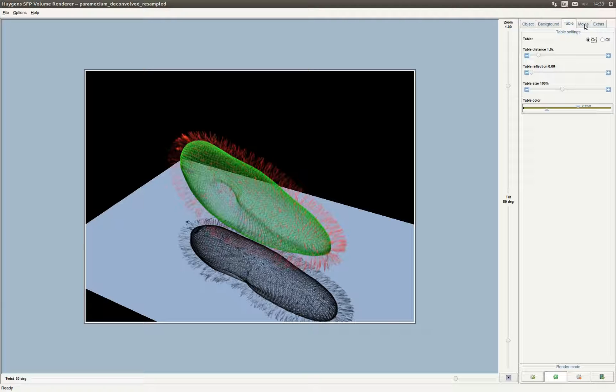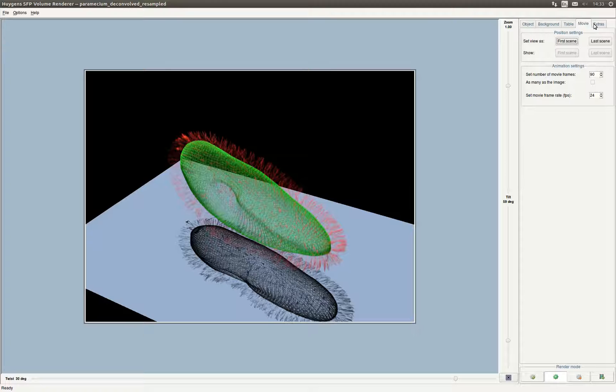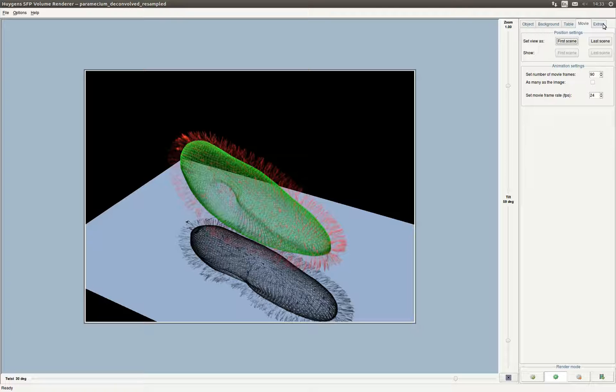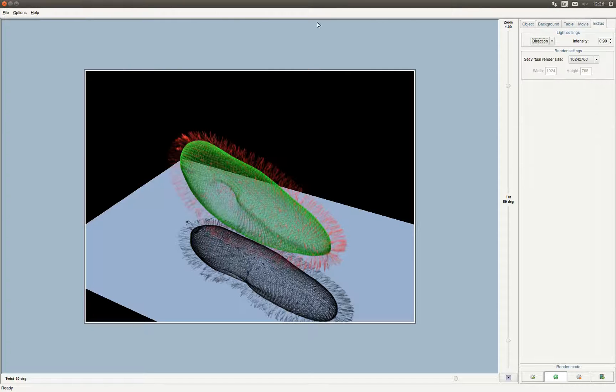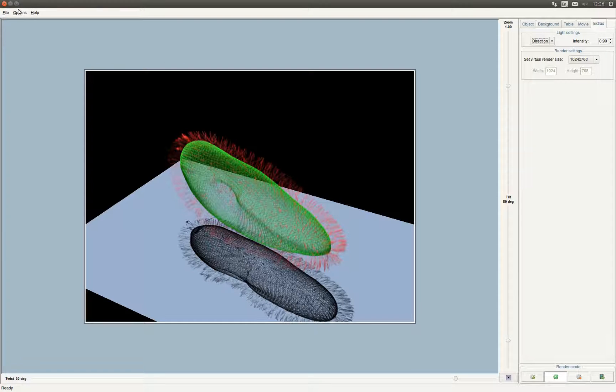In the table tab you can change the settings for the table, like the color, size and if it has reflection and how much. With the movie tab you can create a movie by selecting the first and last scene and then use the render animation button in the right bottom of the screen. Under the extras tab you can select the render size and change the light settings. We now go back to the main Huygens window.